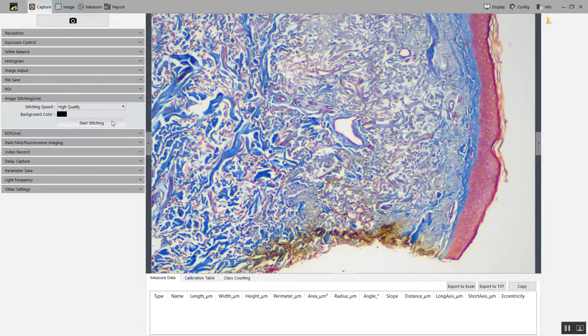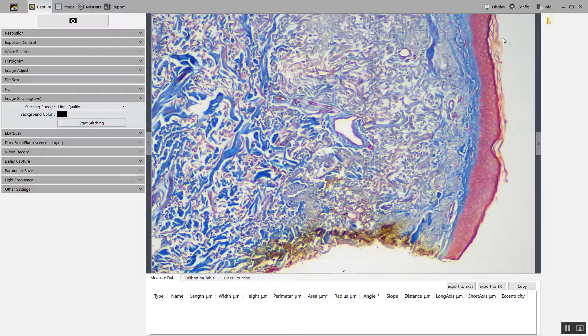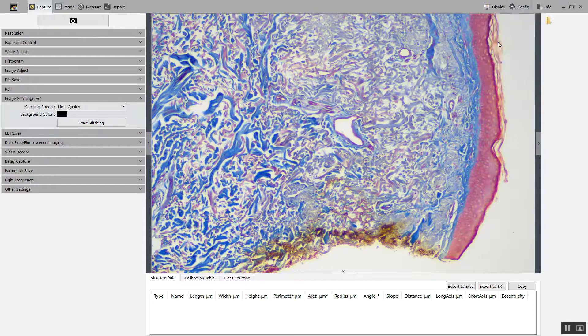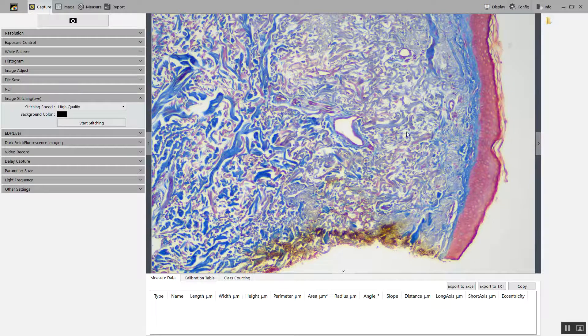Before I start stitching, I want to make sure that I can see as much of my specimen as possible. I'm going to choose display and fit. Now I know that my image is fitting in this window.